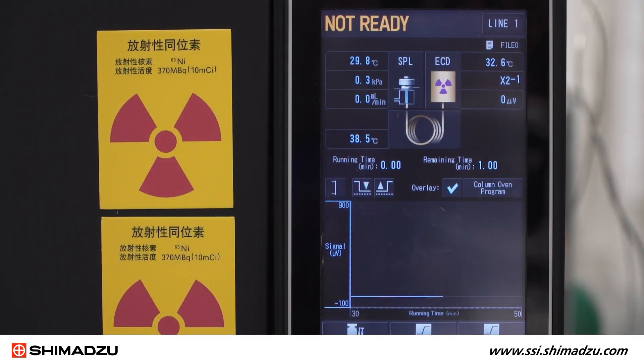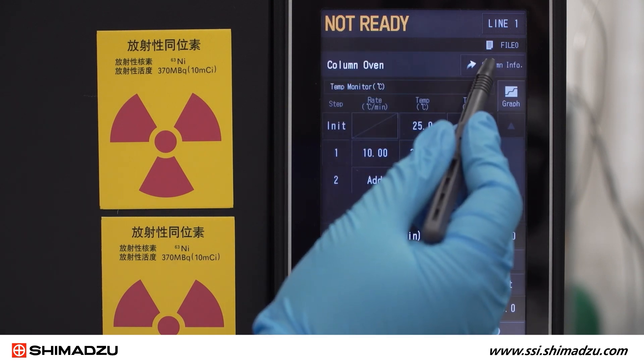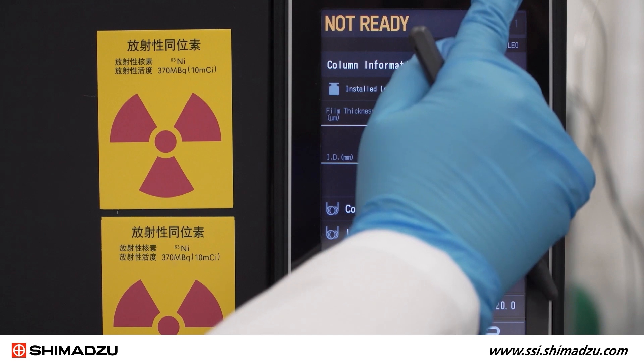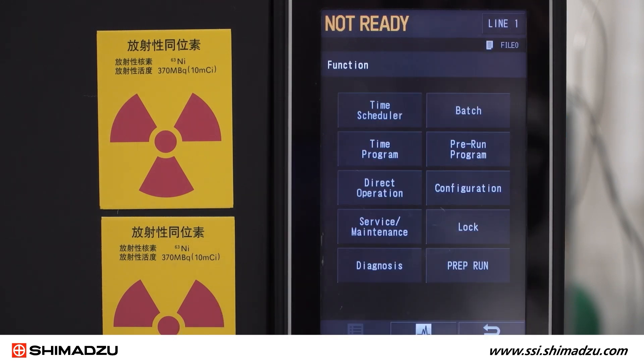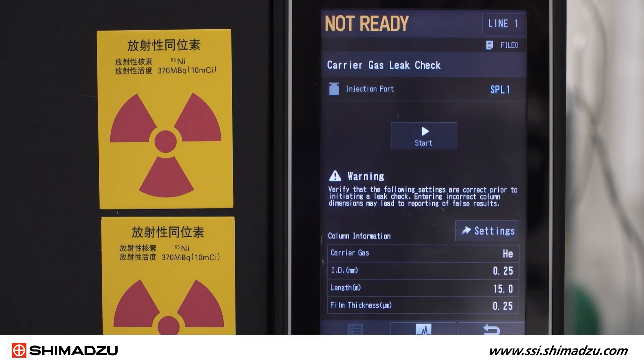Remember to perform an automatic carrier gas leak check before startup. First, check that the column is connected and the correct column dimensions have been entered. The leak check will not be accurate if the column dimensions are not correct. Then, from the home screen, select Function, then Diagnosis, then Carrier Gas Leak Check. Confirm your column dimensions once more, then press Start.